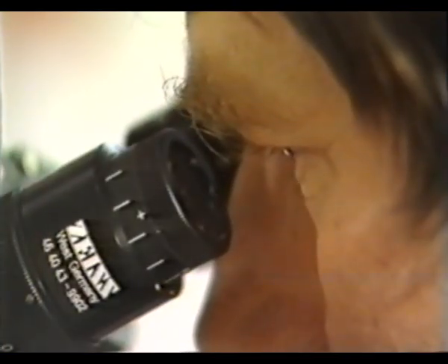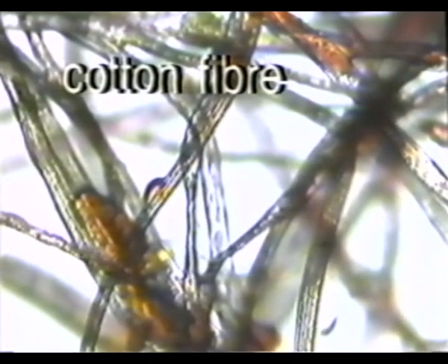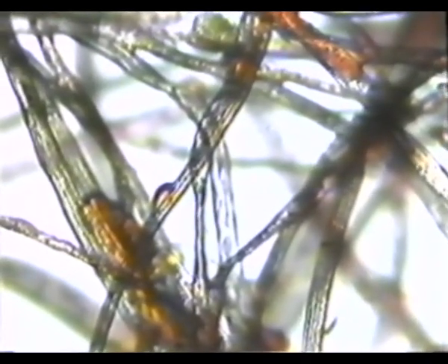Through the microscope, we can see that fatty soil adheres strongly to the fiber surface and thus also retains other types of soil. On this cotton fiber, the fatty soil is easily removed from the fiber surface. However, the soil between the fibers is difficult to rinse out.